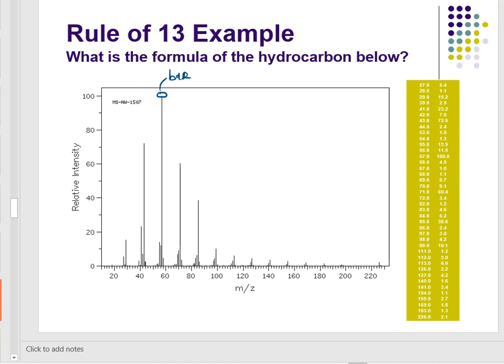I don't do squat with the base peak. I at least want to point it out, though, to tell you that is the most common fragment of this compound. Never forget it. I always like to review it. What's my M-peak? Well, this data over here to the side, it's going to kind of give me that information, because if I look, these are really tiny, and compared to this base peak, these are tiny, but you know, there's peaks out there, and that's a pretty dominant peak right in there, right? I mean, I can see that one.